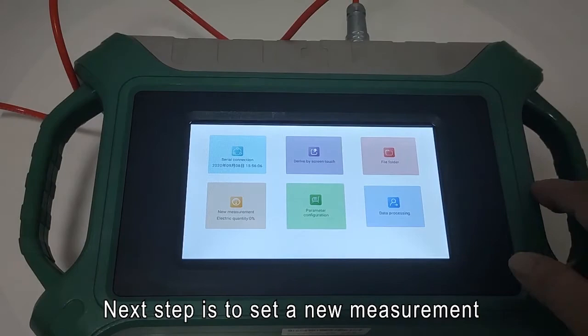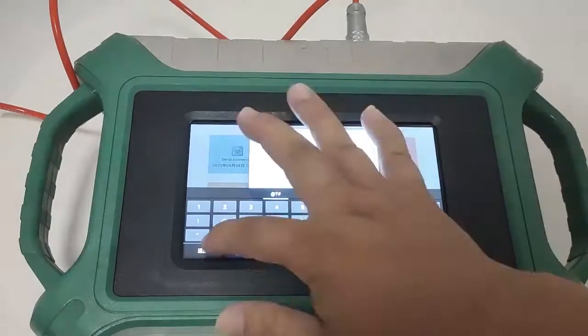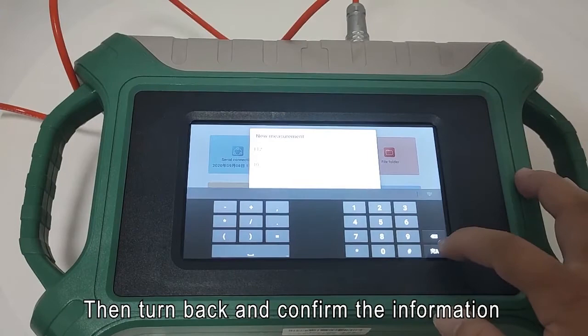Next step is to set a new measurement. Input a number you like to name the measurement file, like 112. Then turn back and confirm the information.